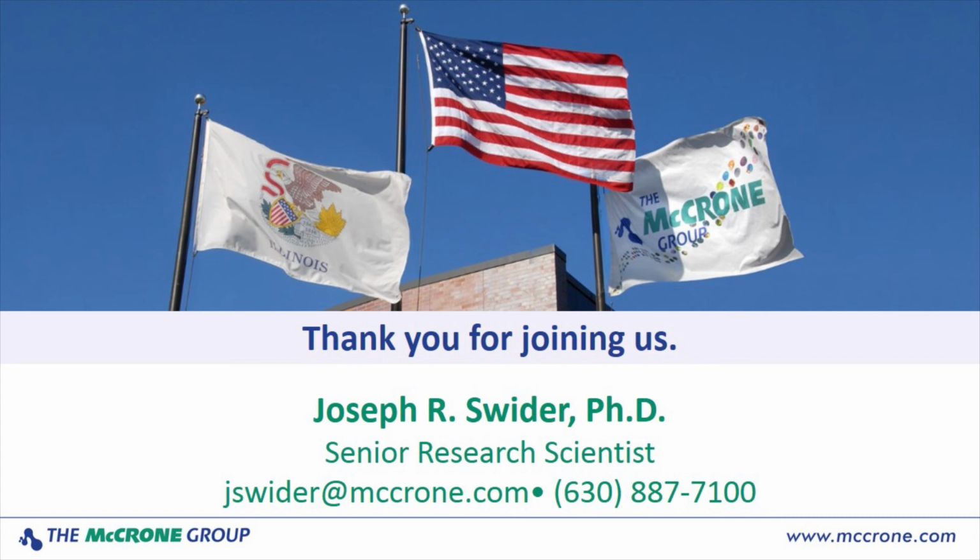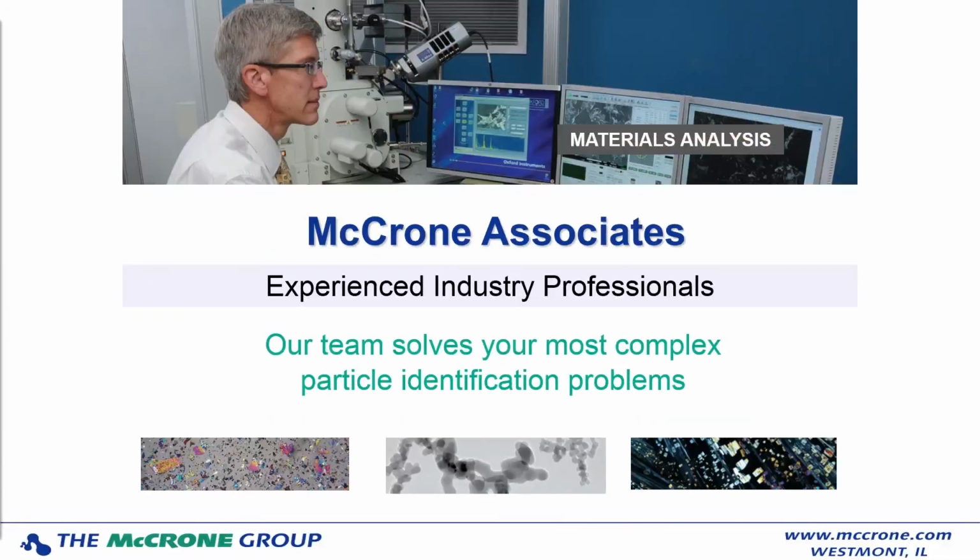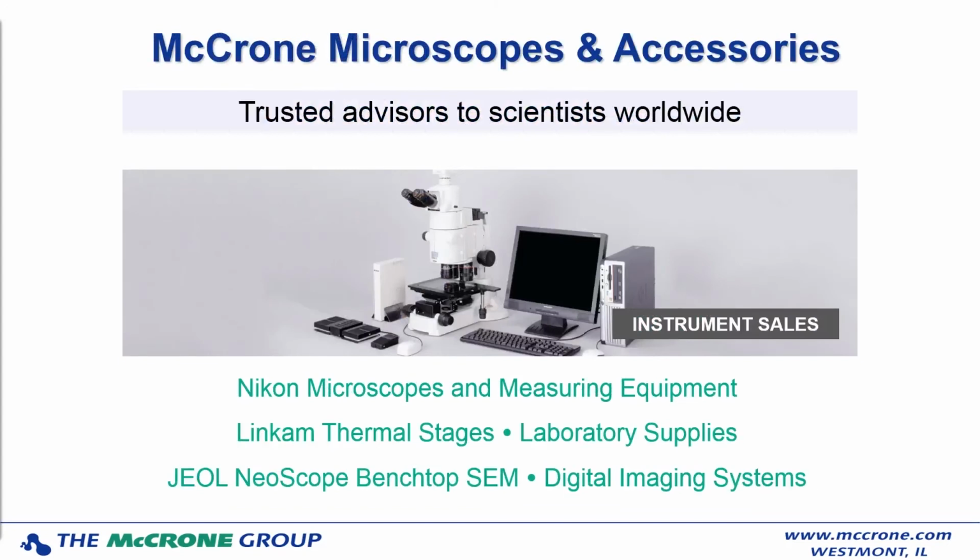Okay, the first question is, what is the typical diffraction acquisition time? And this depends on the size of the sample. Typically for pharmaceuticals, for powders like the sample I just mentioned, we typically run them 15 minutes in duplicate for homogeneity purposes. If we had small particles, say 10 to 20 microns, we may have to run those for half an hour to an hour, depending on how crystalline they are.